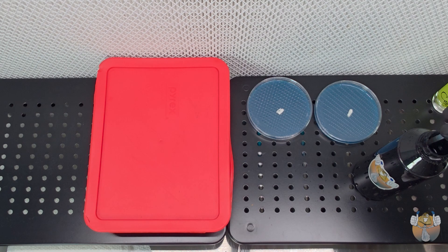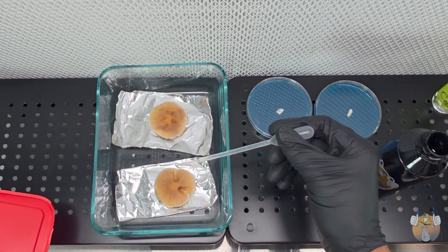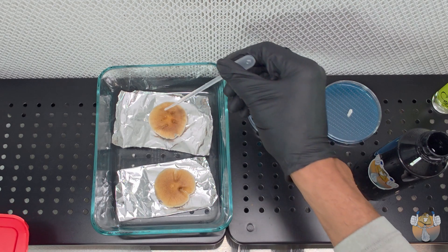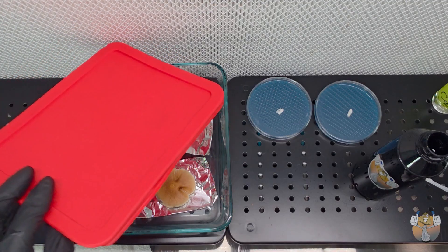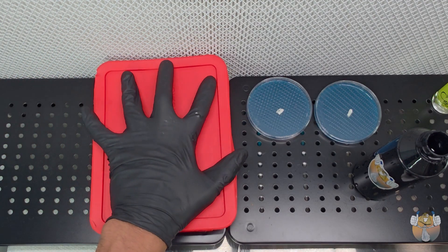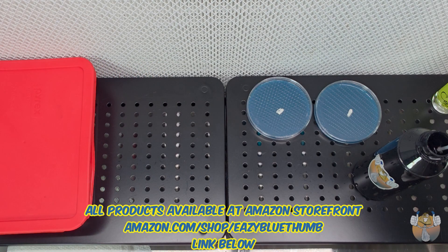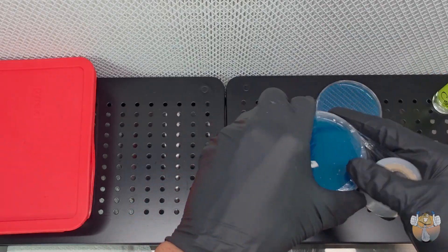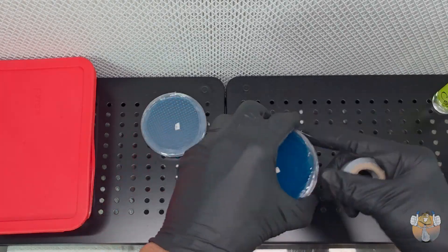Now for our final step for the spore prints, we're going to take our water and put a single droplet onto the cap. This will send signals to it that it's time to drop spores, and it just makes the process a lot easier and a lot quicker. And those are done, simple as that. Now before we shut down the flow hood, we just want to make sure we wrap up our plates and leave them on the counter for a few days.